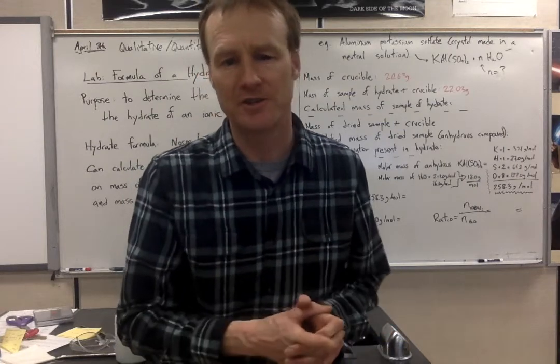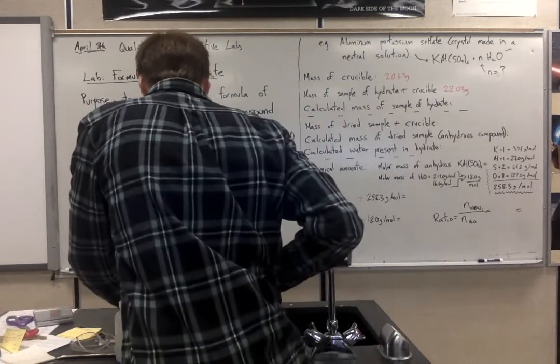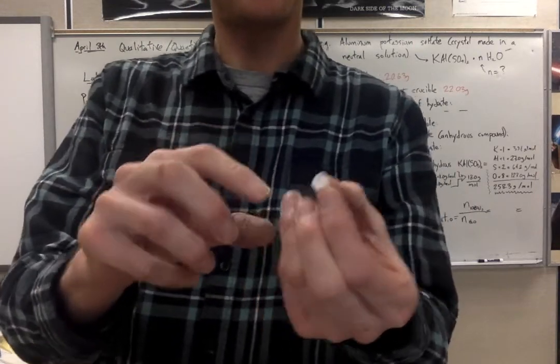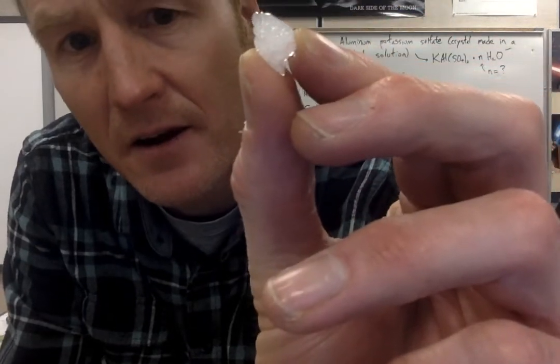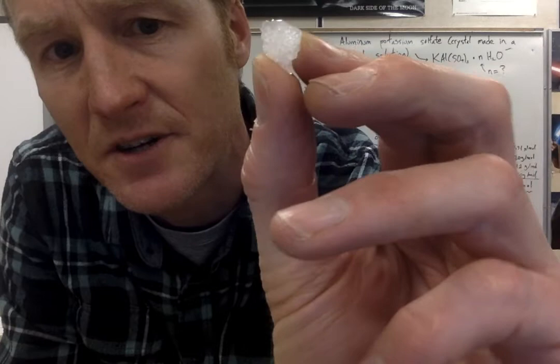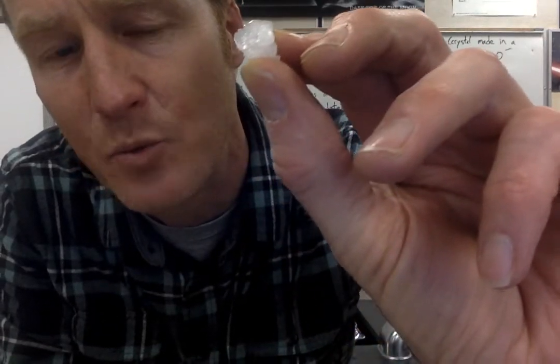First of all, I'll show you what the crystals look like. You go to the grocery store, you can buy this stuff. Let's get that up close to the camera. There. You can see very pretty crystals. You can get them way bigger than this.